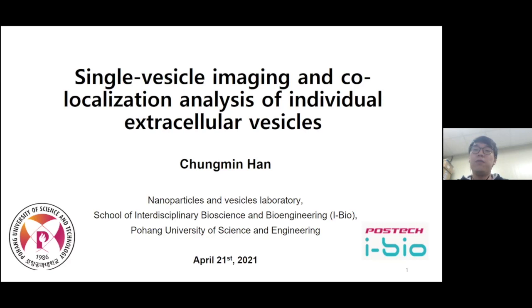For a brief self-introduction, I received my PhD last year, as Camille introduced, and I'm currently working as a postdoctoral researcher at Jae-sung Park's laboratory at POSTECH. My research is mostly focused on single-vesicle analysis and its applications. For today's presentation, I'm going to talk about details of single-vesicle analysis methods that our laboratory has developed. And then I will talk about the results of HEK-293 cell single EV analysis.